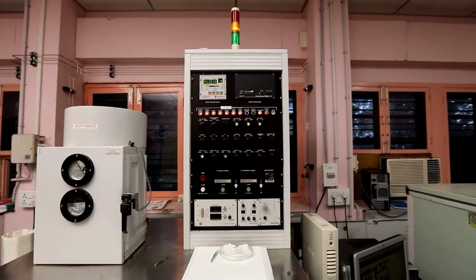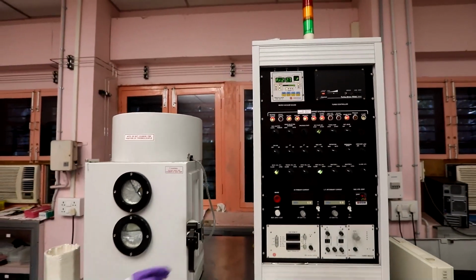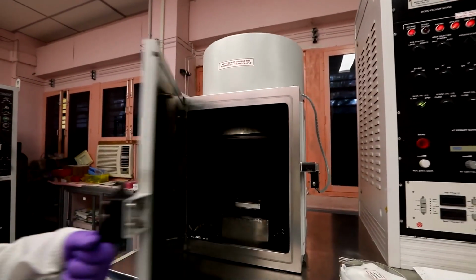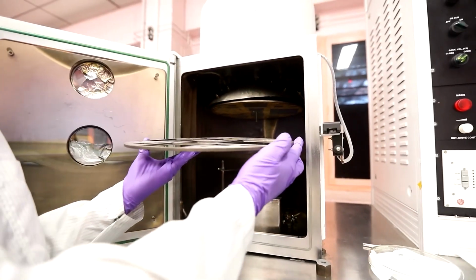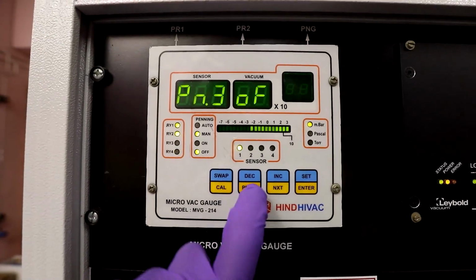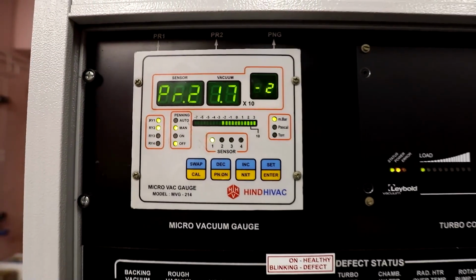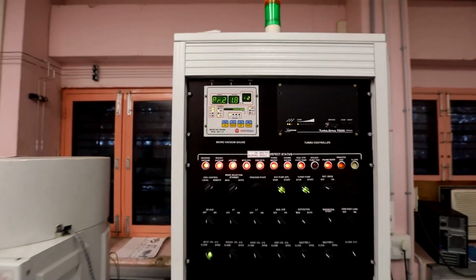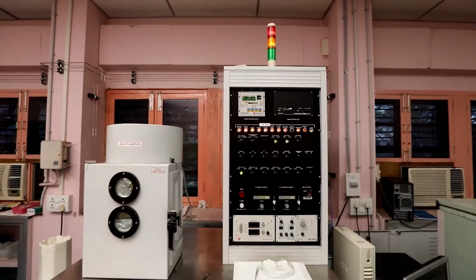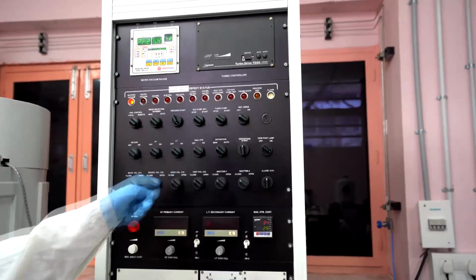Unloading the sample and shut down. We will open the chamber as we have done in the beginning. And now we can see our samples after chrome deposition. At the end, let us close the chamber and create the roughing pressure at 10 to the power of minus 2 millibar inside. Switch off all switches in the reverse order as we did at the start of the process.